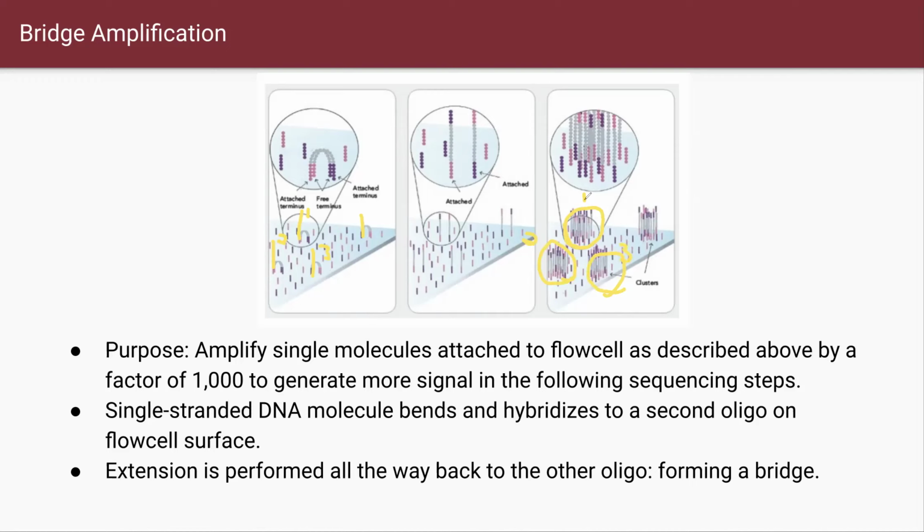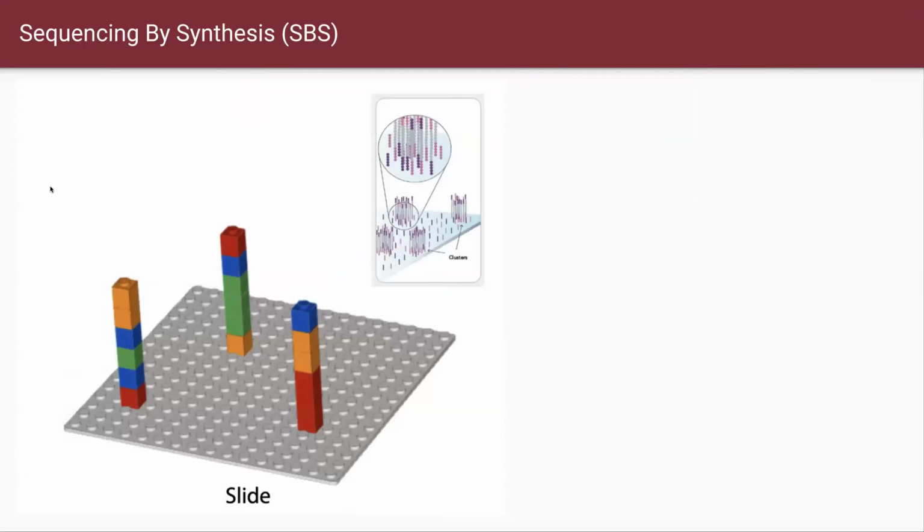This is library 3, and this is library 3's cluster or something like that, okay? So why do we need it? You basically amplify, you basically enhance the signals out of these clusters, right? So this is the requirement. So what is an example? Once you get that information, this is one of the representations. So this is 1, 2, 3, as I mentioned. And for simplicity, I removed all the clusters and just put the representative 1, 2, 3, right?